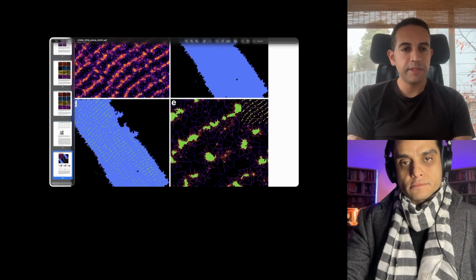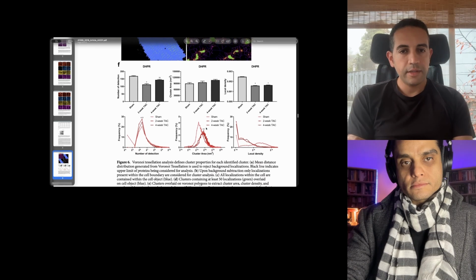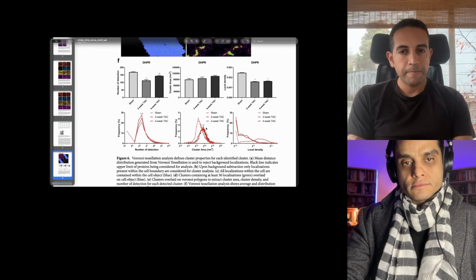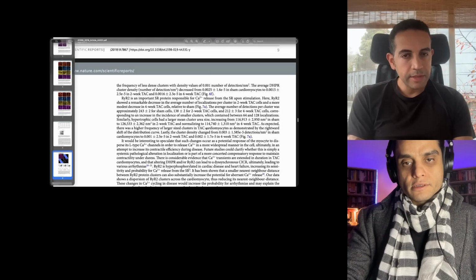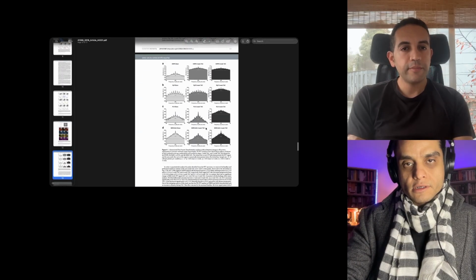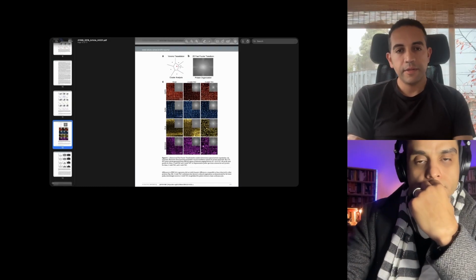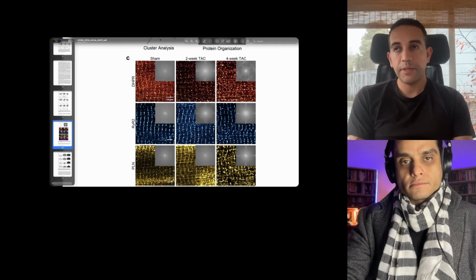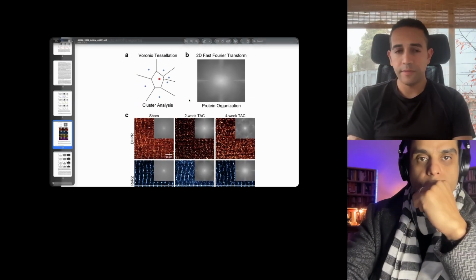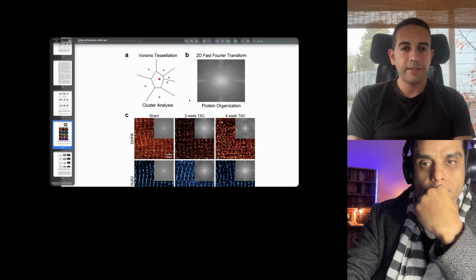And the second metric, if you go down into the last figure, Figure 8, this one. We're able to measure how we're modulating the sizes of the clusters, but to what degree are we impacting the actual distribution in 2D?